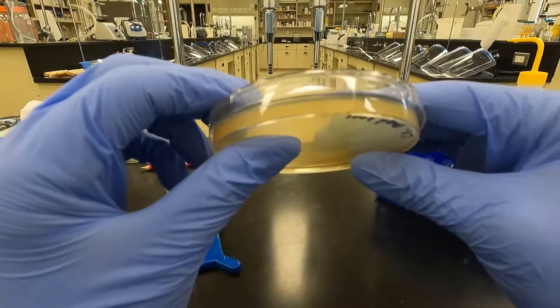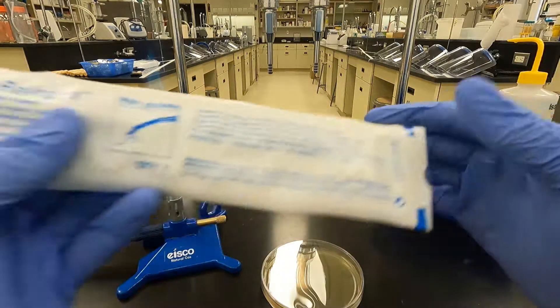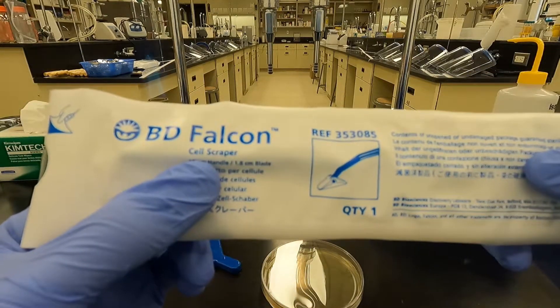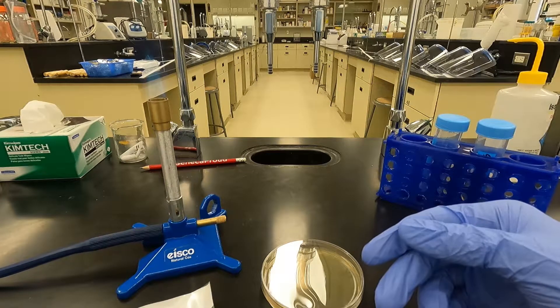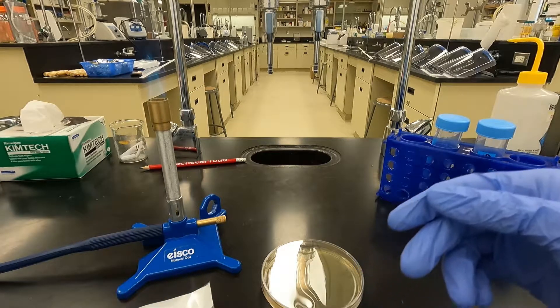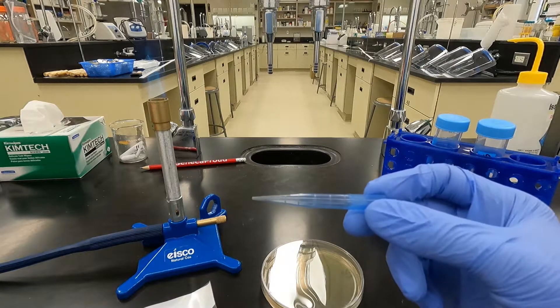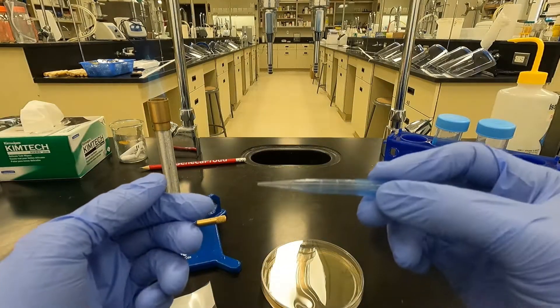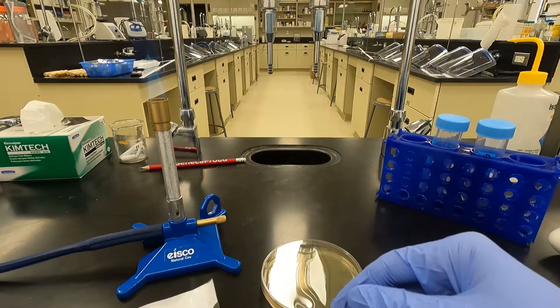We're going to work with this plate here and collect that top layer. I like to use the cell scraper — this one right here is pretty good. You can also use a pipette tip, like a blue tip or a yellow tip. It's a bit harder, but you just take a sterile tip and scrape the agar off with a gentle scraping motion. But I prefer the cell scraper.